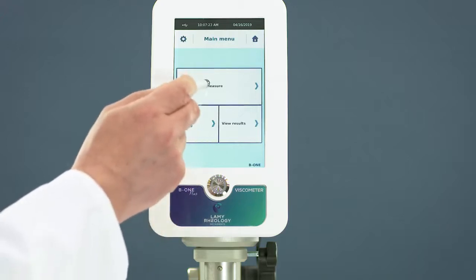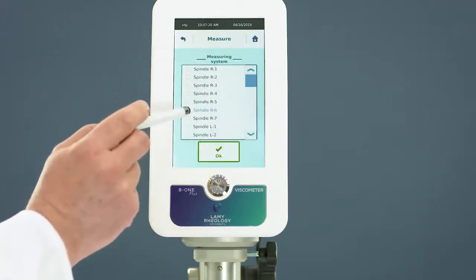You can now set your measure. Choose the spindle, the speed, and the duration.